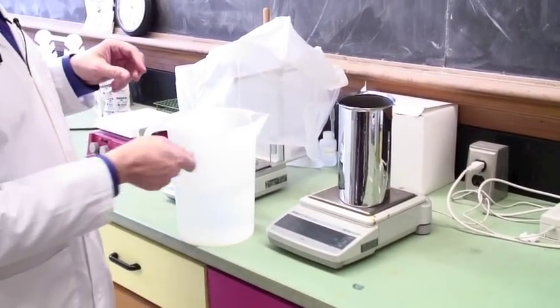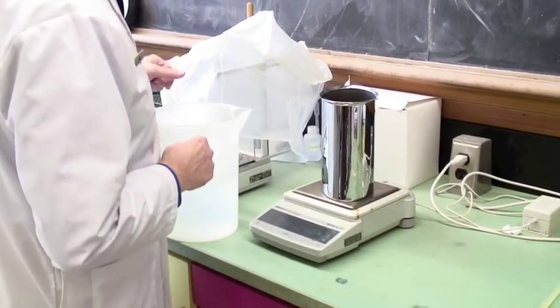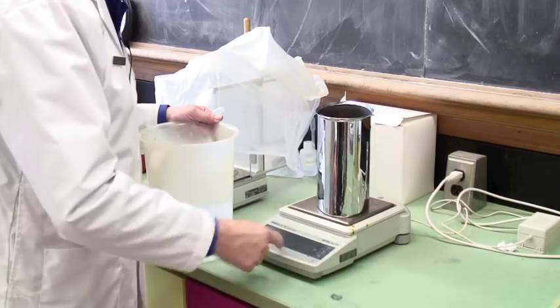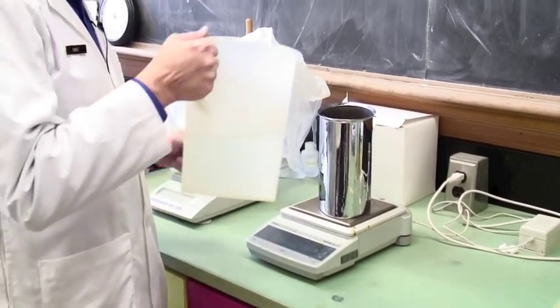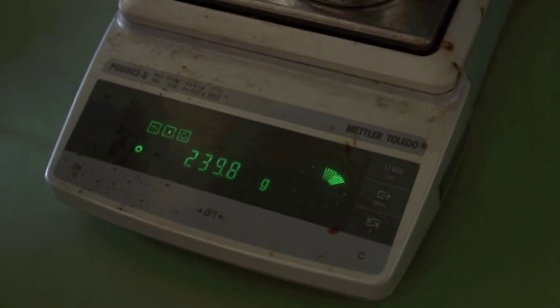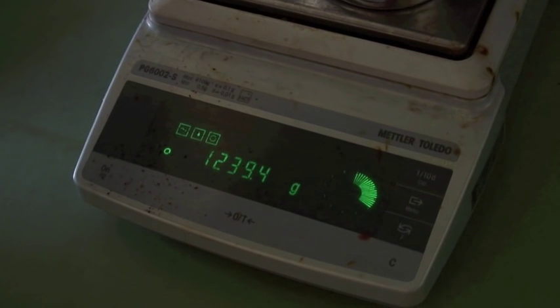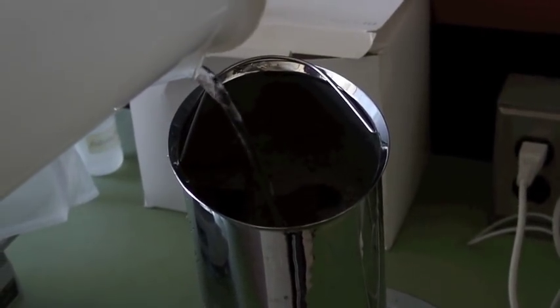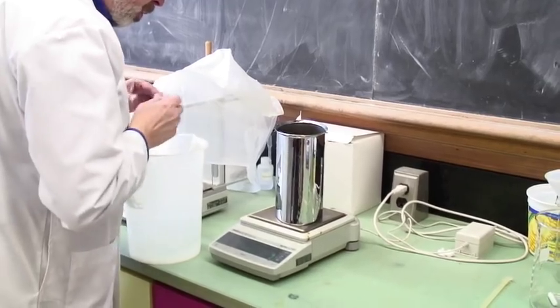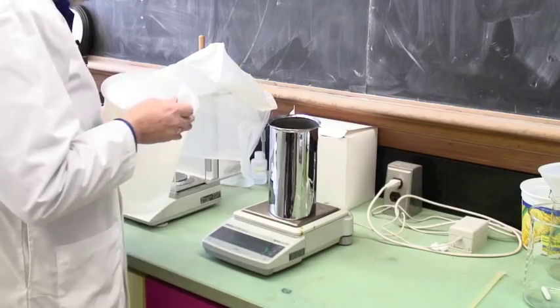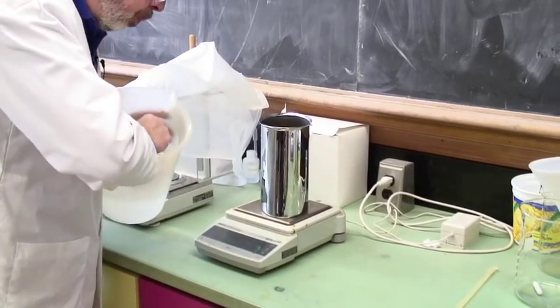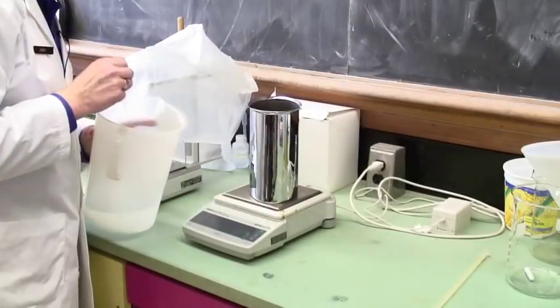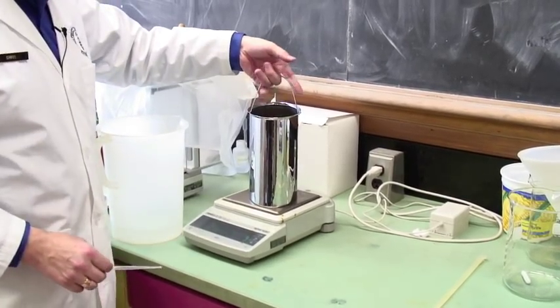To weigh this out you need a high capacity balance. We've only got one of these and it will weigh up to six kilograms. You need exactly two kilograms of water. Put the bucket on and hit the tare button so it goes to zero, and then first of all just pour. Add the last bit by dropper so that you can get to exactly two thousand point zero. We've now got the appropriate charge in the water bucket for the calorimeter.